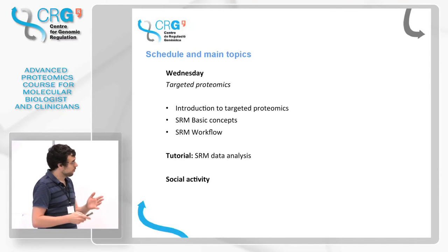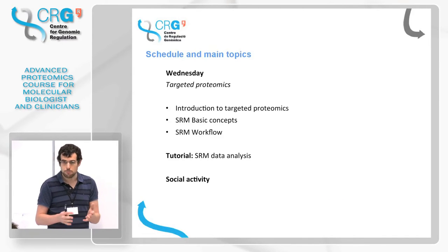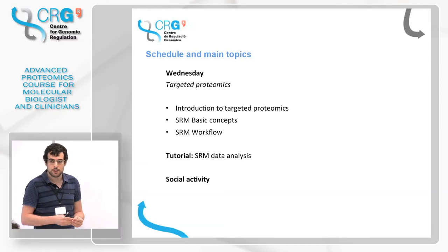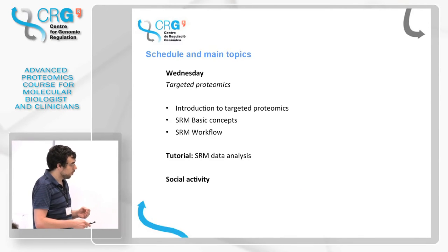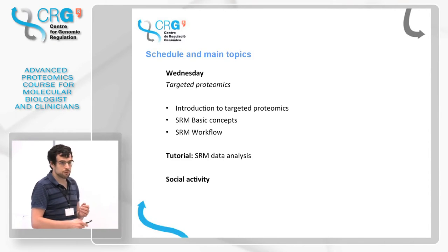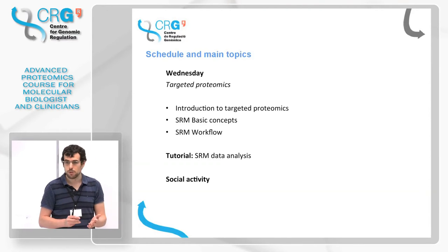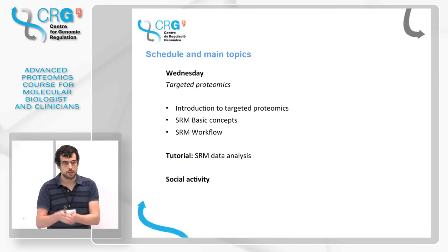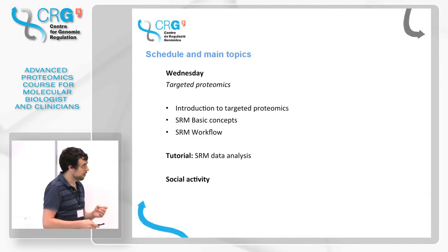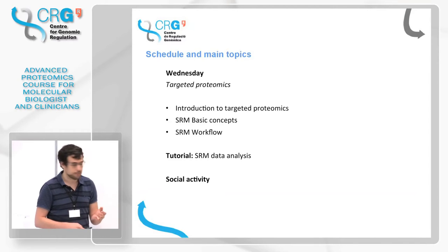proteomics. Eva will introduce what targeted proteomics actually is, in which type of experiments it is recommended to use targeted proteomics, and the concepts of one of its techniques, which is SRM, that probably some of you already know, and which is the workflow. So how we choose our proteins, and from the proteins, how we choose the peptides that we want to monitor, and from there, how we acquire the data and how we analyze this data. We will put everything into practice in the tutorial on how to analyze targeted proteomics data.